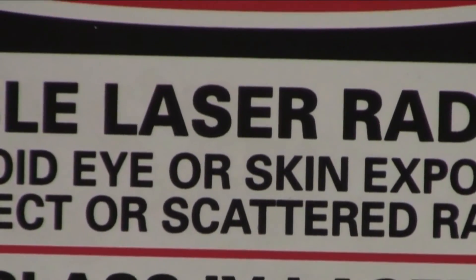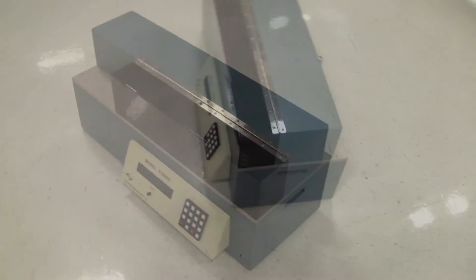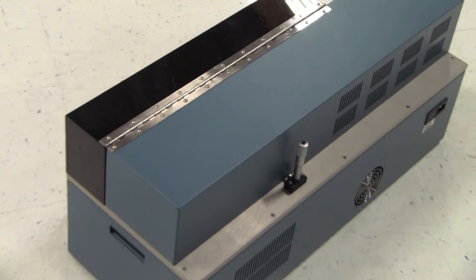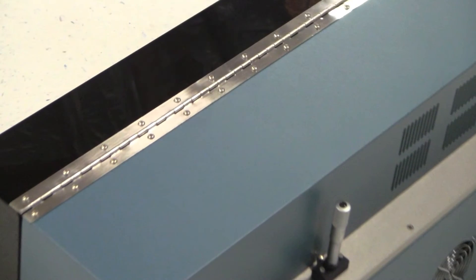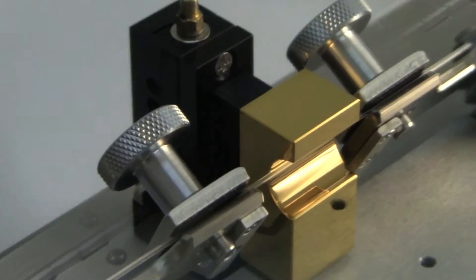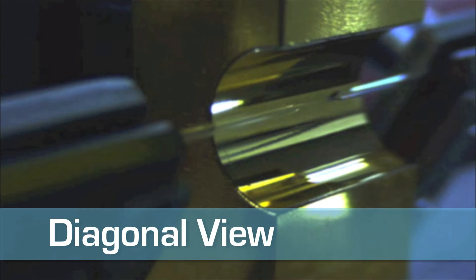In our series of tutorial videos, we will watch micropipettes in the process of being pulled. Viewing the P2000 puller from its back at an angle, the retromirror is oriented like this. Zooming in from this perspective gives us an example of the diagonal view, in which we get a good look at the retromirror, the clamps of the puller bars, and of course, the glass capillary. We will take a closer look from the same point of view, focusing on the glass capillary.